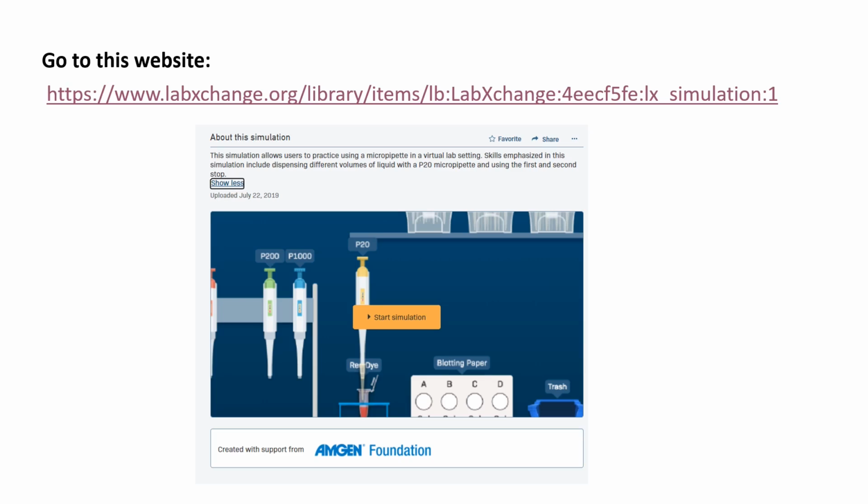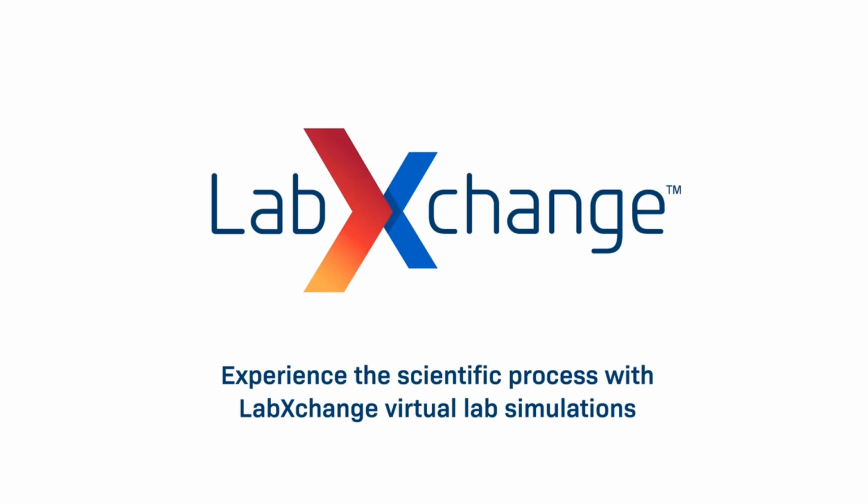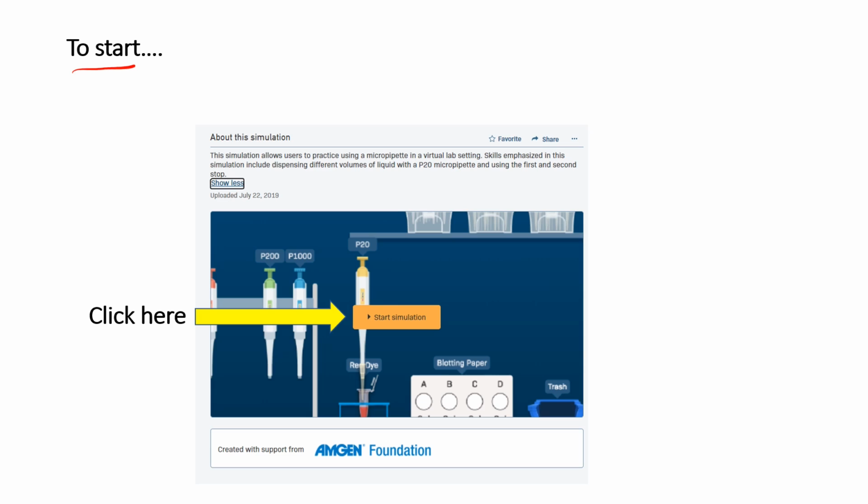In this lab, you will learn how to use a micropipette in a virtual setting. To do that, I want you to go to this website and you will see this virtual lab. I know that you already watched the lab exchange video, so if you haven't watched it, please go back and watch that one. To start the simulation, you just have to click here and it will start the simulation.